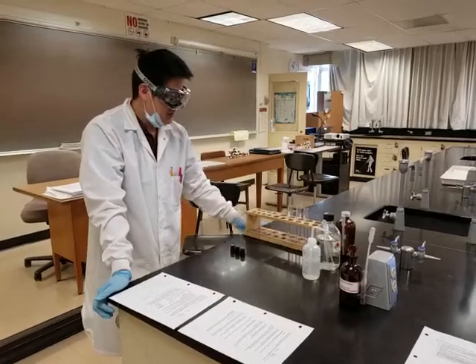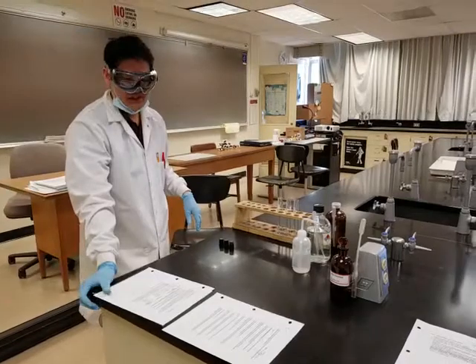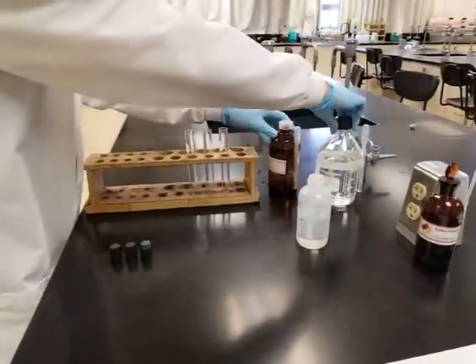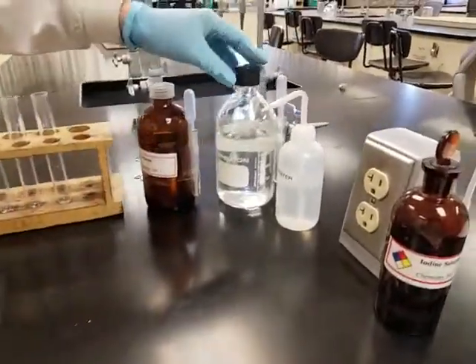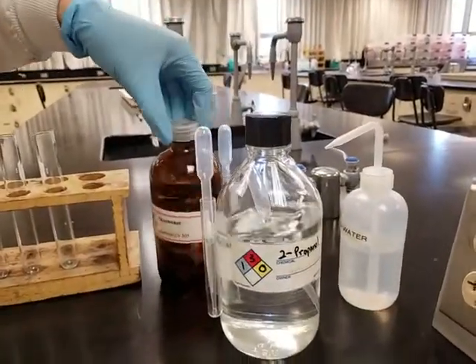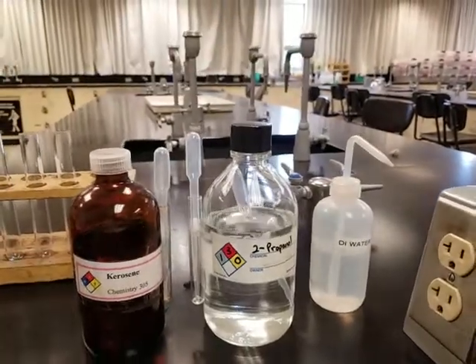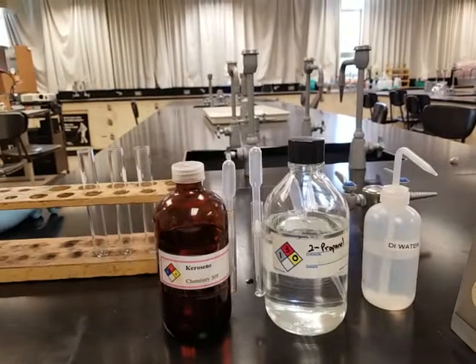All right, so this is part C of Lab 13, where we're discussing the miscibility of liquids. We're going to take a look at these three liquids over here. We have DI water, we have isopropyl alcohol, also known as 2-propanol. They're the same thing. Then we also have kerosene. Kerosene is kind of like gasoline, so oil-like. And we're going to find out if they mix with each other or not.